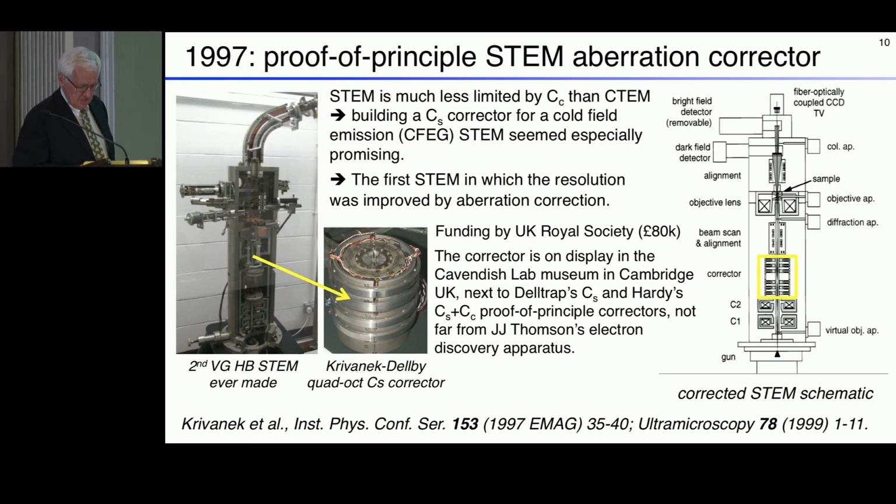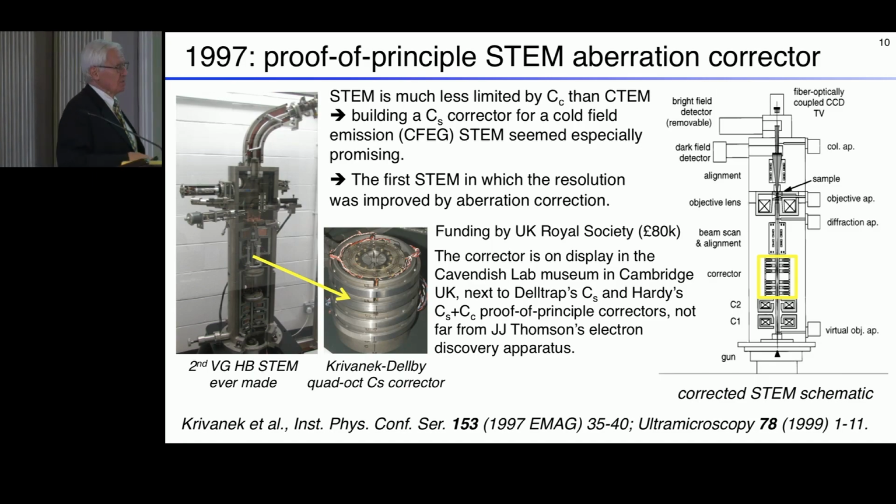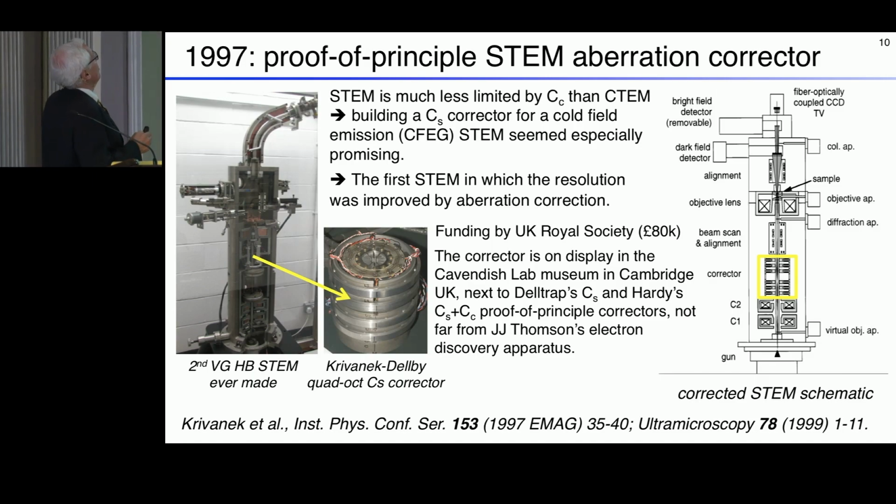Quite a powerful technique. And also in optical processing. So look at the diffraction pattern pixel by pixel in an image. There is a lot of supplementary information which is very useful. Our proof of principle STEM is now in the Cavendish Museum.